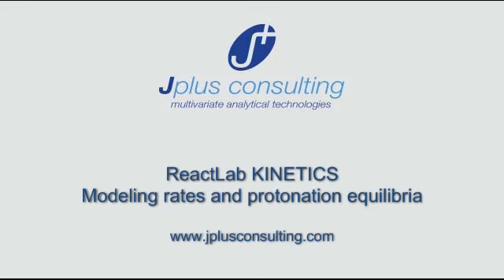This tutorial is intended to demonstrate the use of ReactLab Kinetics to model and analyze a complex mechanism in coordination chemistry. It illustrates several more advanced features of ReactLab, including the ability to include both kinetically observable rates and rapid equilibria in the reaction model, and also to correctly compute and model pH changes associated with protonation steps. It also illustrates the use of auxiliary parameters.